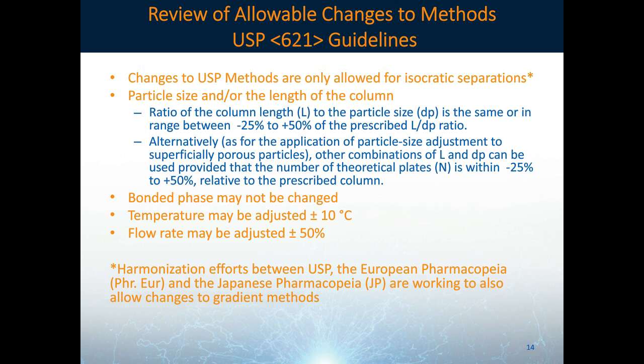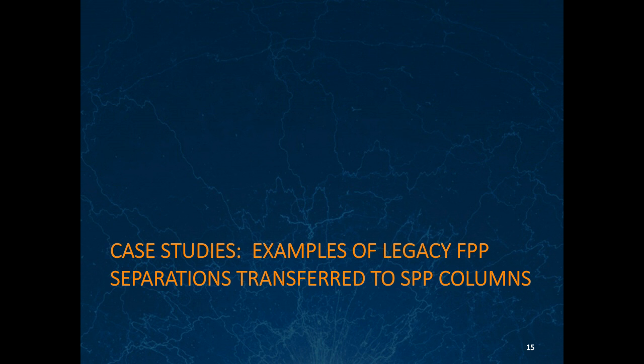So now I'd like to go over some case studies where we have examples of legacy FPP separations transferred to SPP columns.